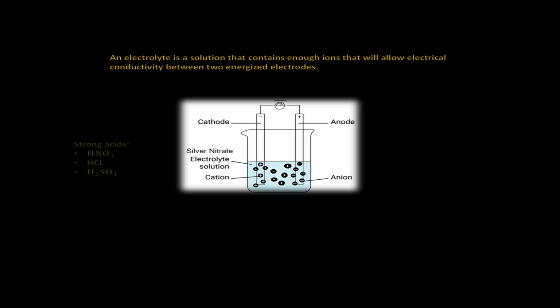Solutions containing strong acids such as nitric acid, hydrochloric acid, and sulfuric acids, having dissolved elements, that is, the metals of interest, this includes nonmetals, are electrolytic solutions. When the electrodes are energized with enough potential, the solubilized ions will start to migrate towards their oppositely charged electrode. Positive ions start to move towards the cathode, while negative charged ions start to move towards the positive anode. At the same time, an electrical current is established which resistively flows through the electrolyte, albeit small in amperage.